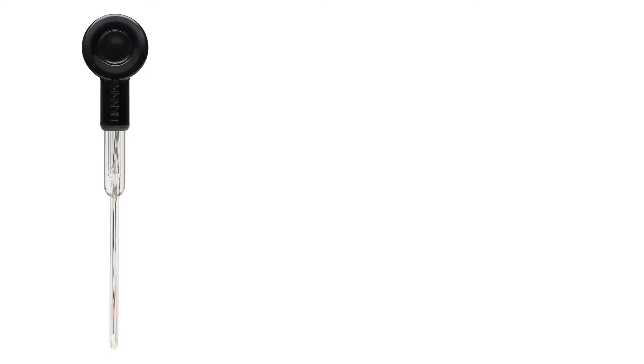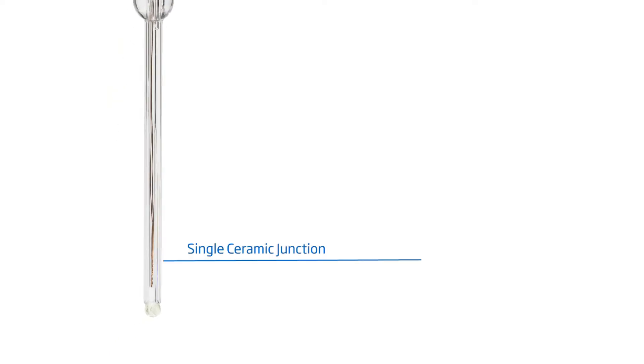This 5mm micro bulb electrode features a single ceramic junction in the outer reference cell, and the small spherical pH sensing portion is made with low temperature glass and is designed with an integrated temperature sensor. This design consideration is ideal for pH measurements in vials, test tubes, and smaller vessel applications.